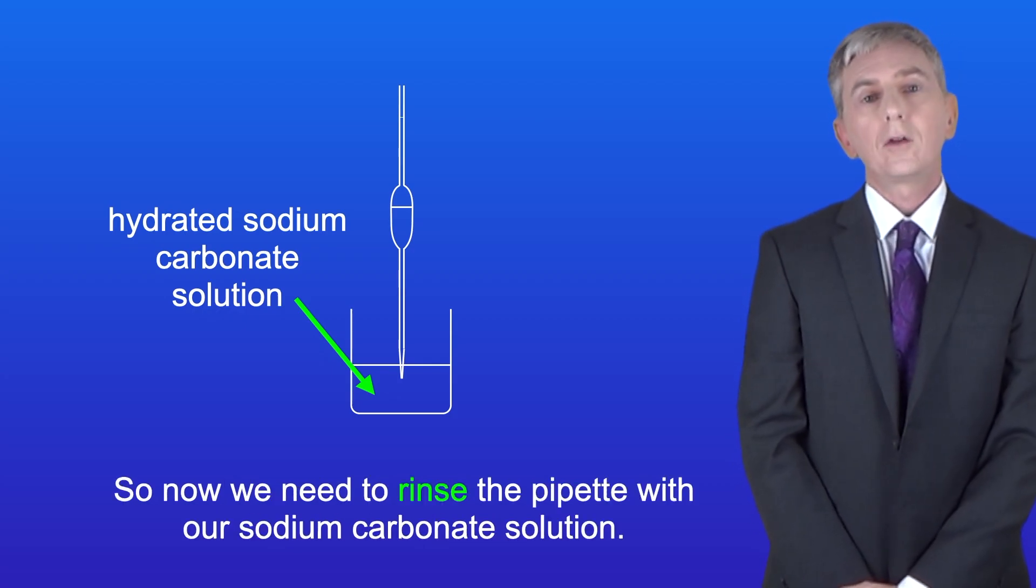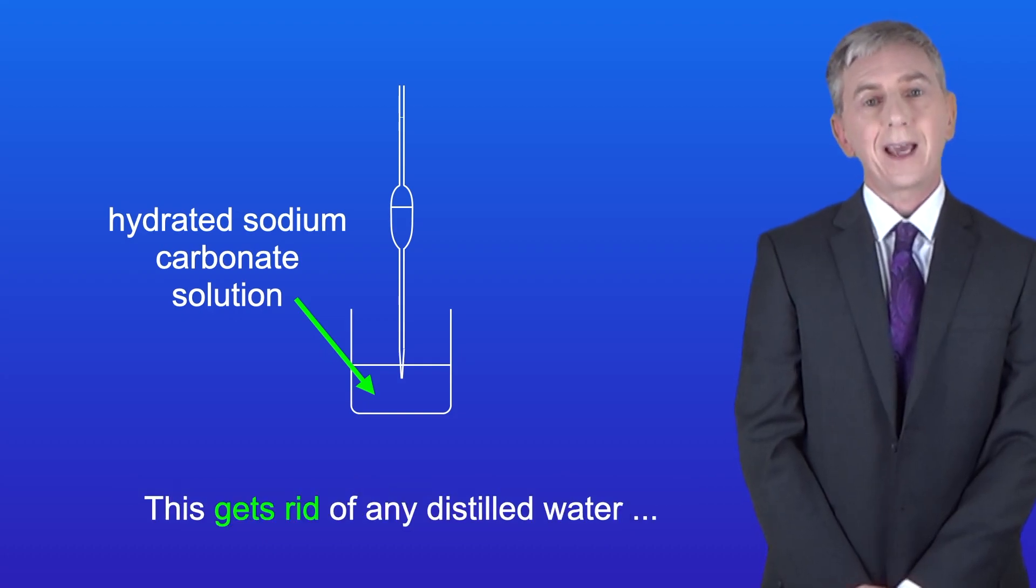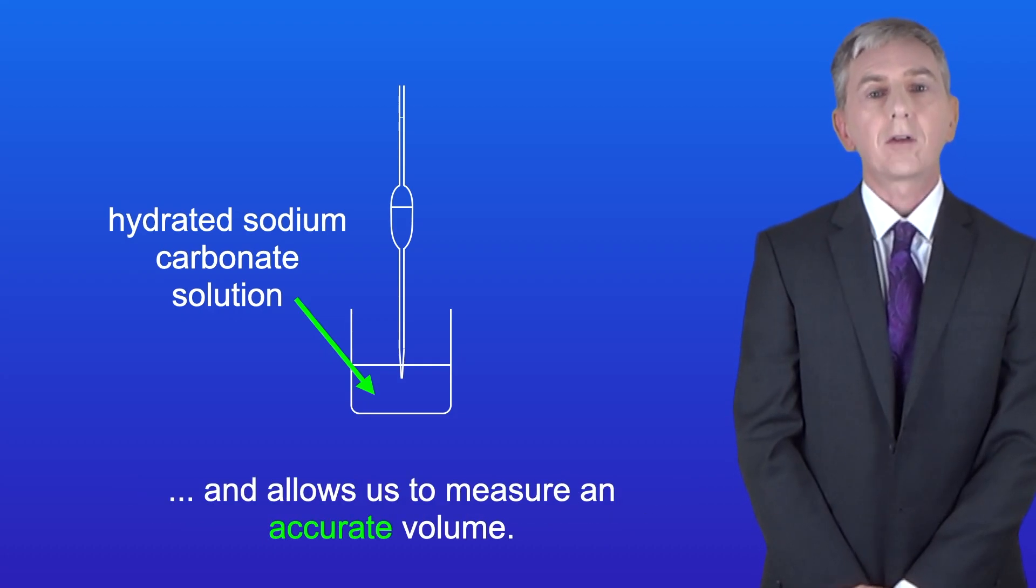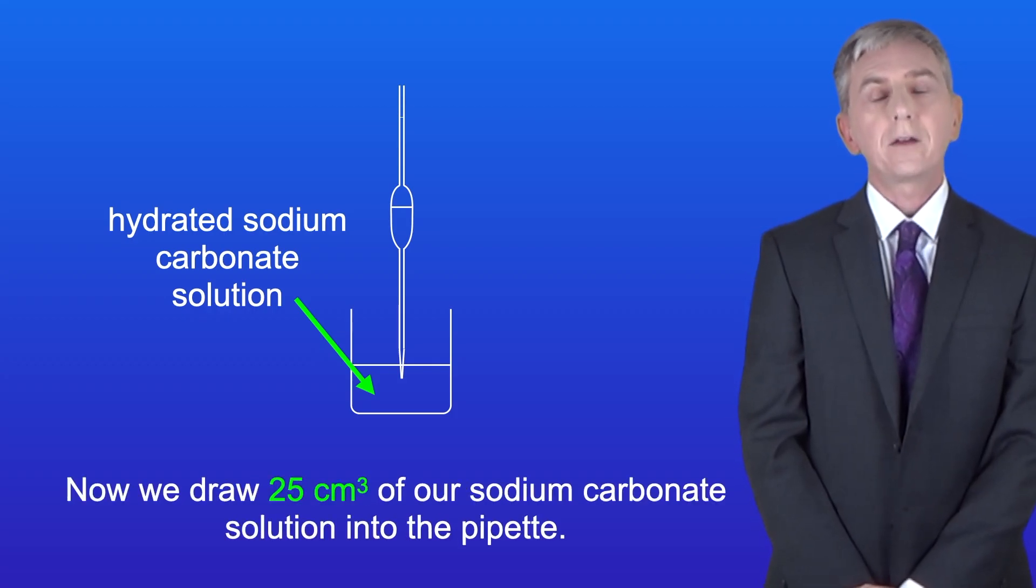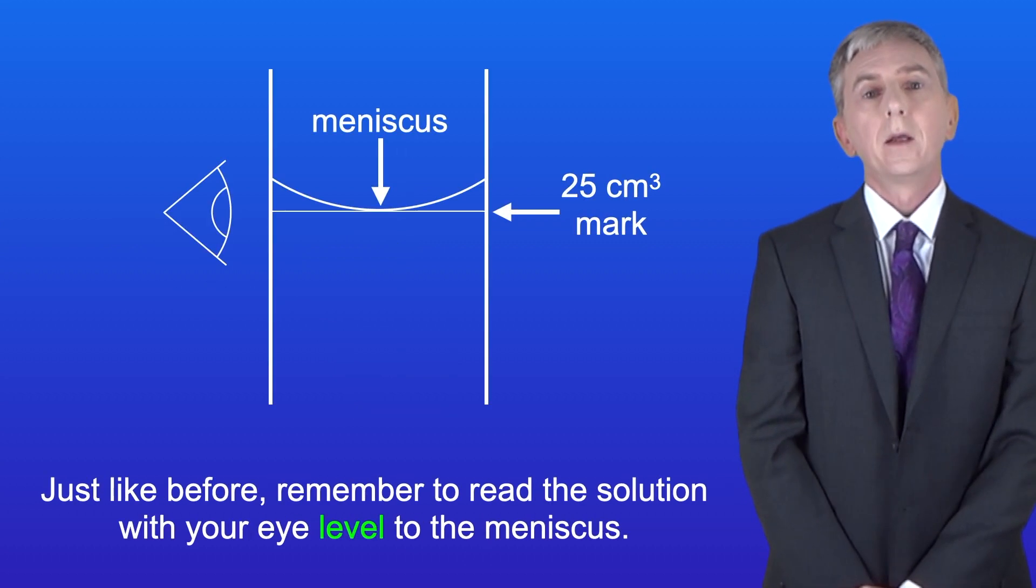That's because the traces of distilled water would contribute to the volume of liquid in the pipette. So now we need to rinse the pipette with our sodium carbonate solution. This gets rid of any distilled water and allows us to measure an accurate volume. So now we draw 25 centimeters cubed of our sodium carbonate solution into the pipette.